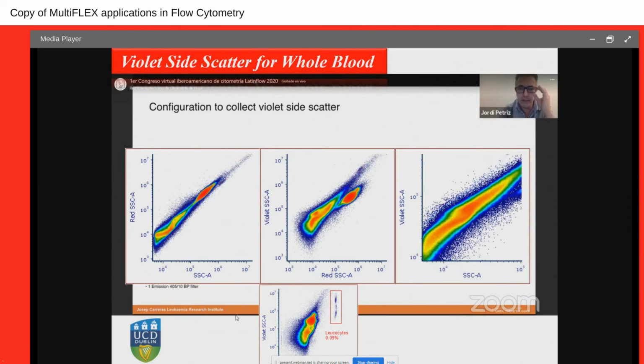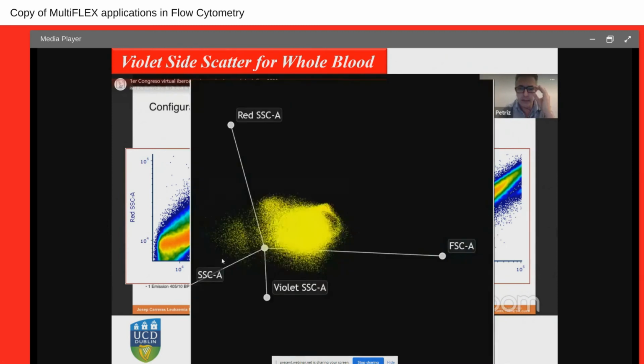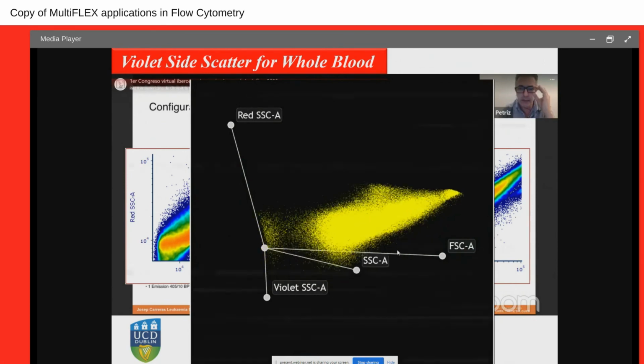Let's go closer, and we'll go now to the platelet section. What we can see in this platelet section is that we have different shapes of these platelets, which means that we might be ending up with new subpopulations of platelets. We don't know. The next step is trying to sort them out.